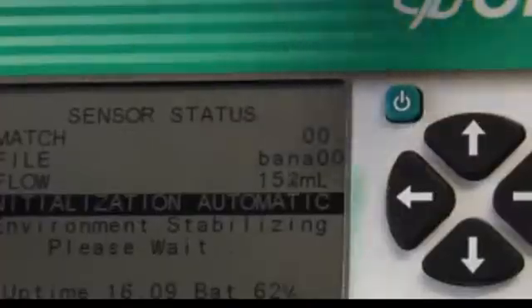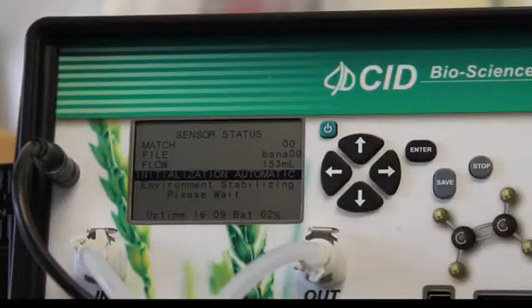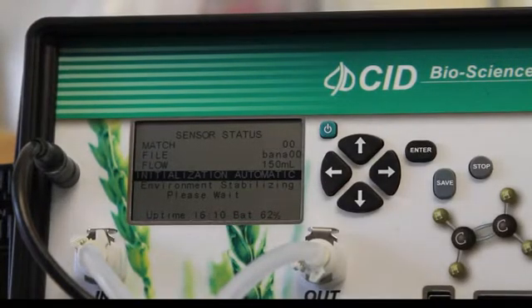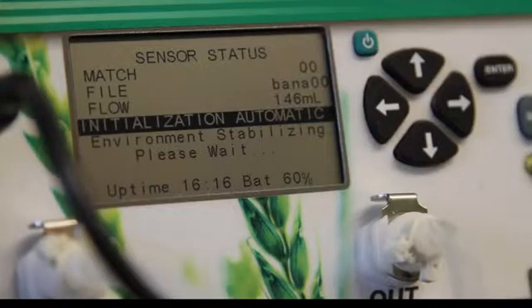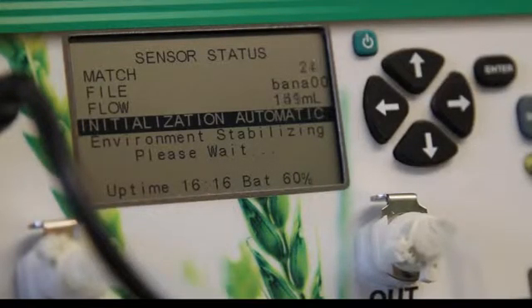The match numbers in the upper right hand corner will start to increase after about 3 minutes when we start to approach equilibrium. This will reach 100 consistent measurements and then start an initial loop. Every time the CI900 gets a data point that is outside a very tight average, it drops back down to zero.